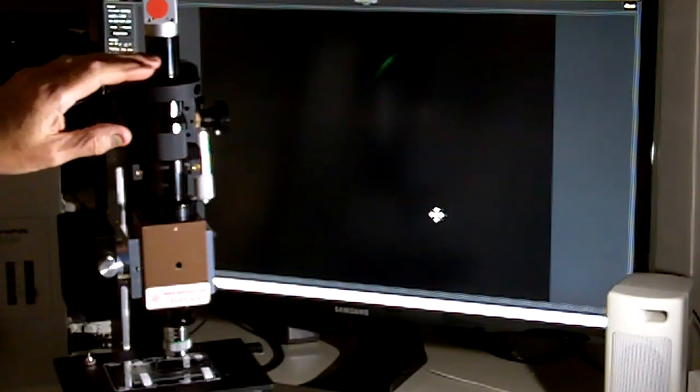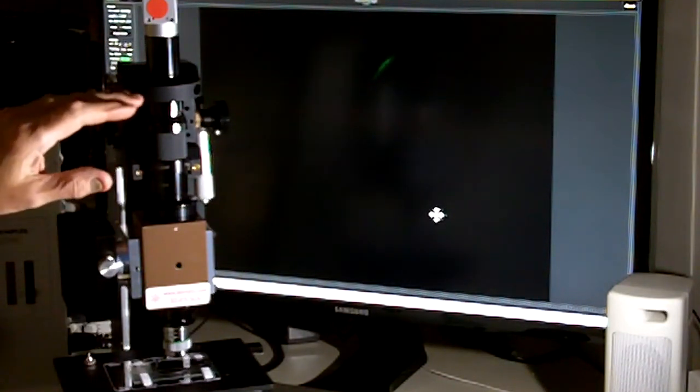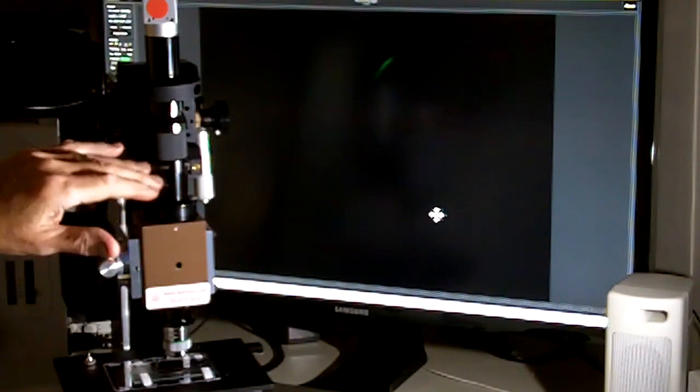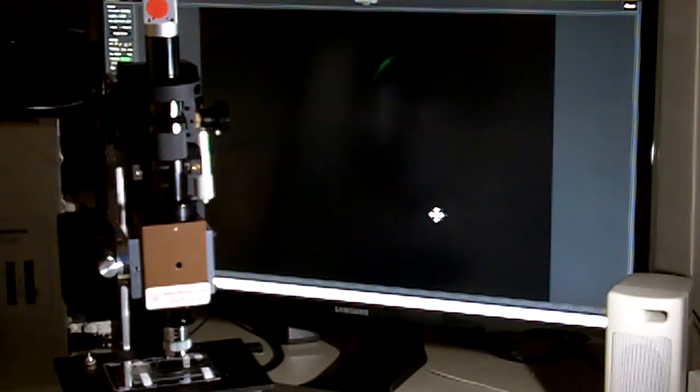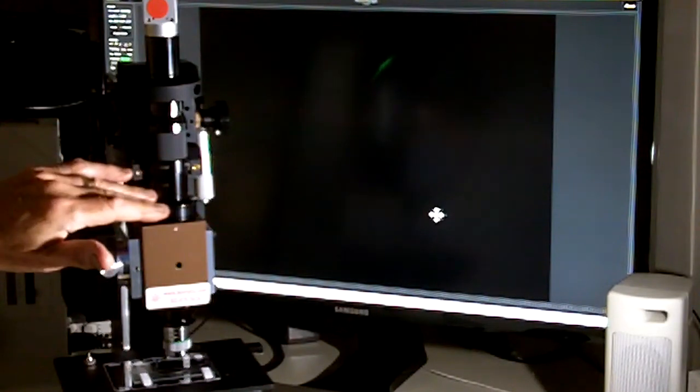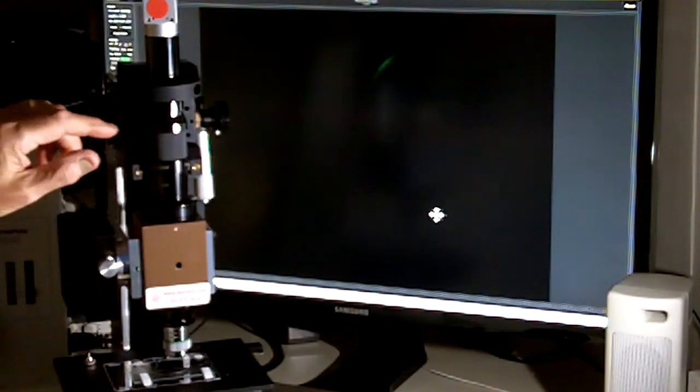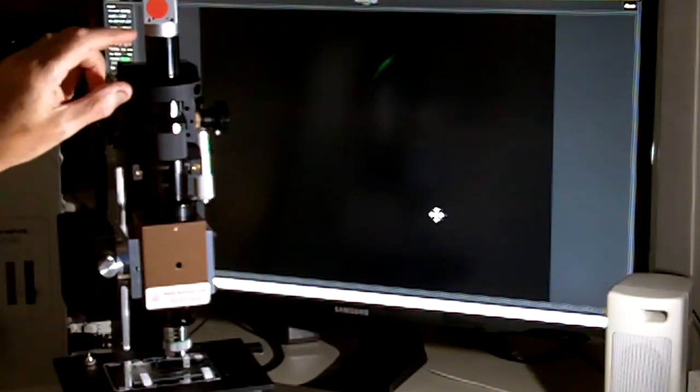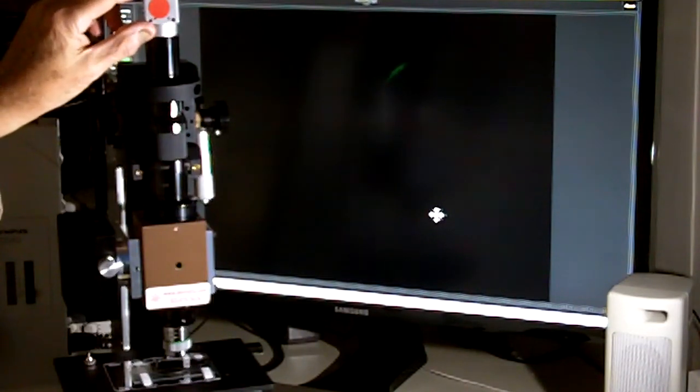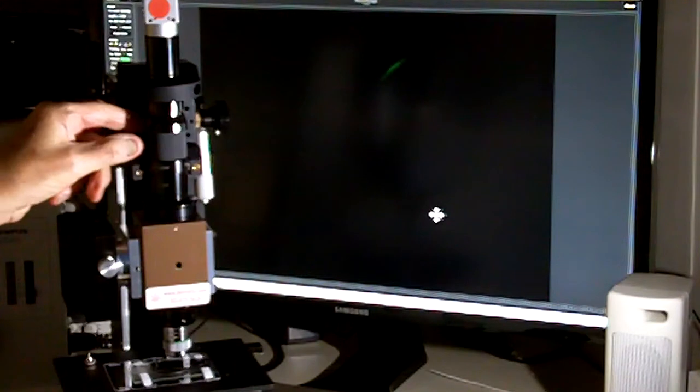The other microscope that we're offering with the MHS microscope stand is made here in the United States by Infinity Photo Optical out in Colorado. This is the model KC. The KC is unique in that we can put a C-mount camera on here or a large format digital SLR camera.